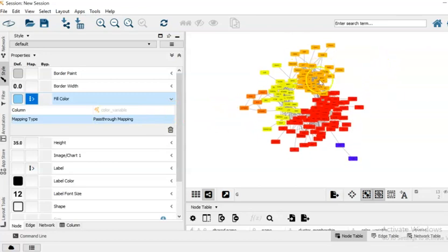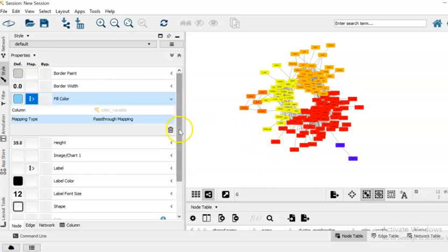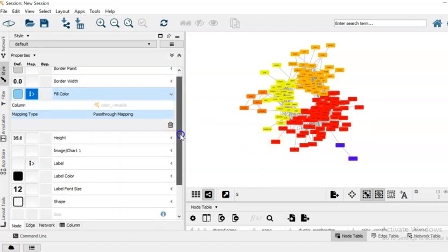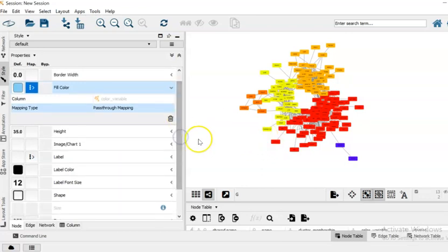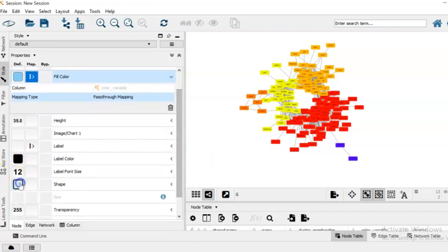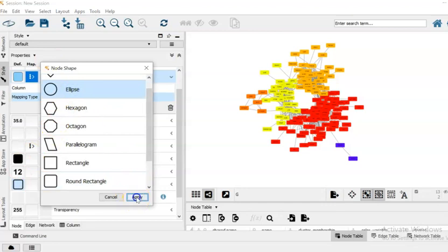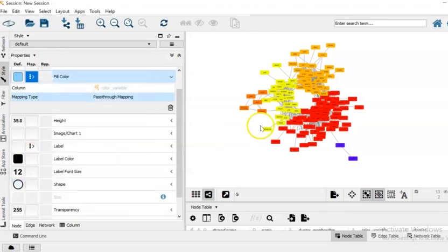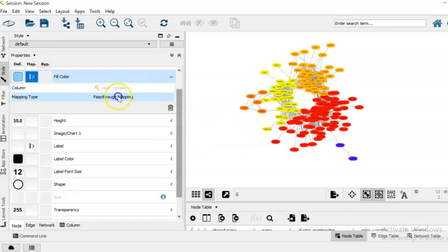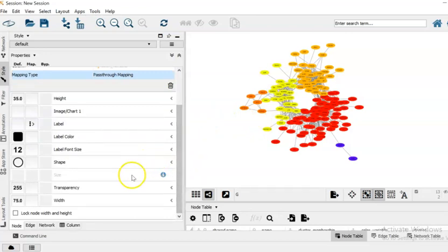Once we do that you can now see the borders and also the nodes that belong to a particular local community. I don't particularly like the fact that our nodes look like squares and I would like to change that to ellipse. So from shape, ellipse, apply, they're going to become ellipses.